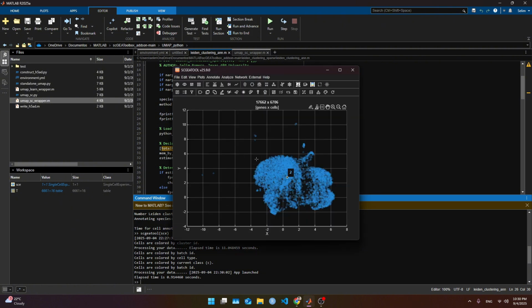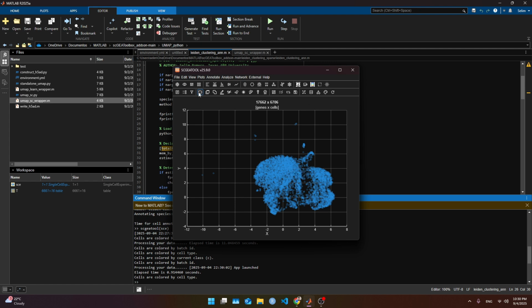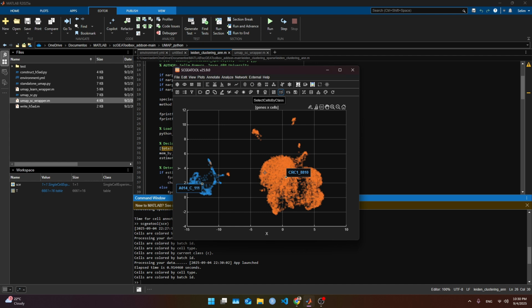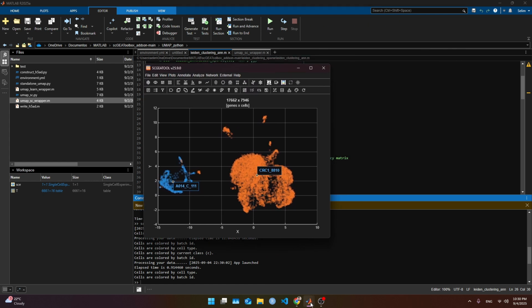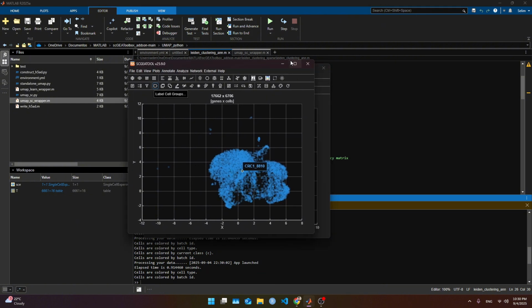Now we're going to have only the neuron cells. That has to be named like that. With this, we can see if the batches are there or not. Okay, cool, we have some neurons. Do we? No, it just swapped. We don't have neurons in the other sample.